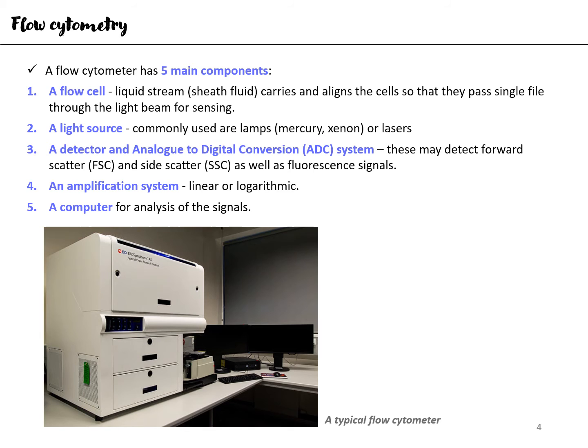So you can't just add your cells to the flow cell and leave it there indefinitely. So you add little by little cells and you resuspend them to ensure that the cells are not really clumping together as they are settling down in the container under the effect of gravity. Because you have to keep in mind that cells will settle down under the effect of gravity if kept static for a prolonged period of time. So that has to be avoided.